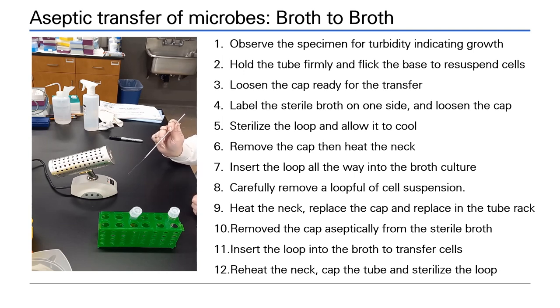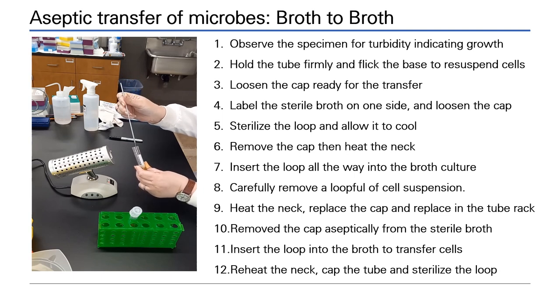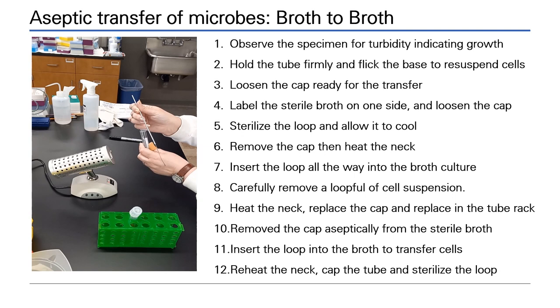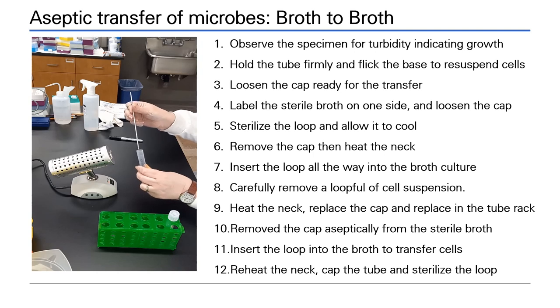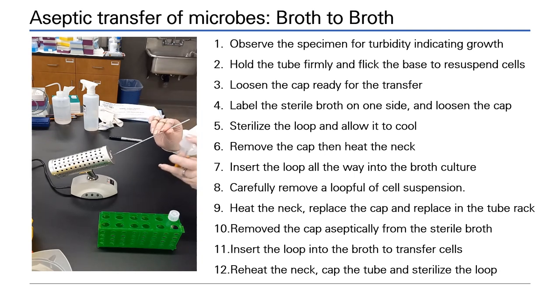Take your inoculating loop, but remember to allow it to cool before entering the culture, otherwise you will kill cells. Hold the culture tube with your non-dominant hand and remove the lid with the dominant hand, wrapping your little finger carefully around the cap. Heat the neck of the tube to add a barrier to contamination. Insert the loop and carefully remove a loopful of culture. Reheat the neck and replace the cap. Reheat the tube, then place the culture into the rack. Remember, your loop is contaminated and must be re-sterilized.